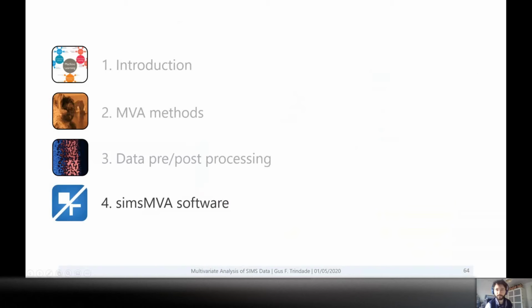Okay, sorry, those are the last few slides. We'll finish very soon. I just wanted to introduce SIMS MVA in preparation for the next one. So before, I will just give 5 seconds again for questions.